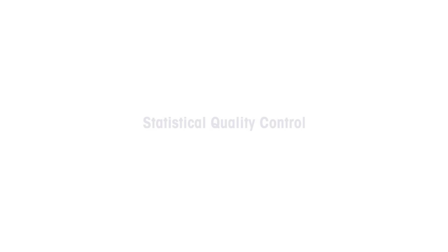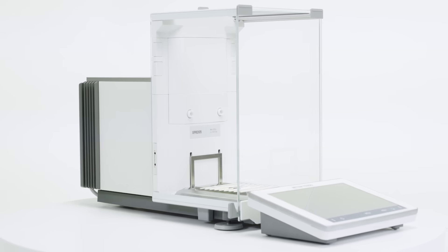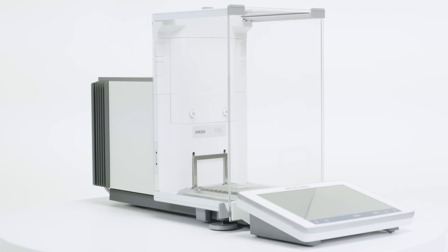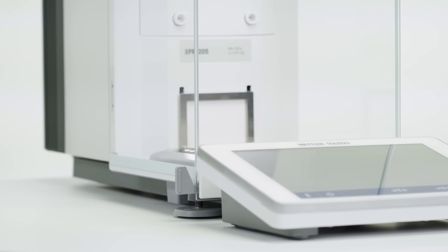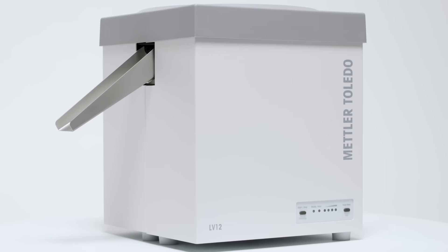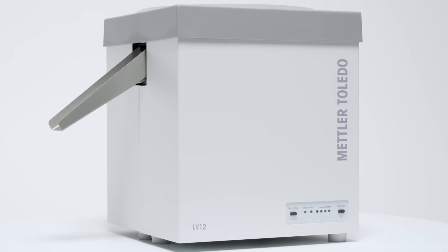The answer is simple – by checking the uniformity of dosage units using Statistical Quality Control. An XPR analytical balance with the SQC Balance software and the LV12 automatic feeder is a powerful standalone statistical quality control system.